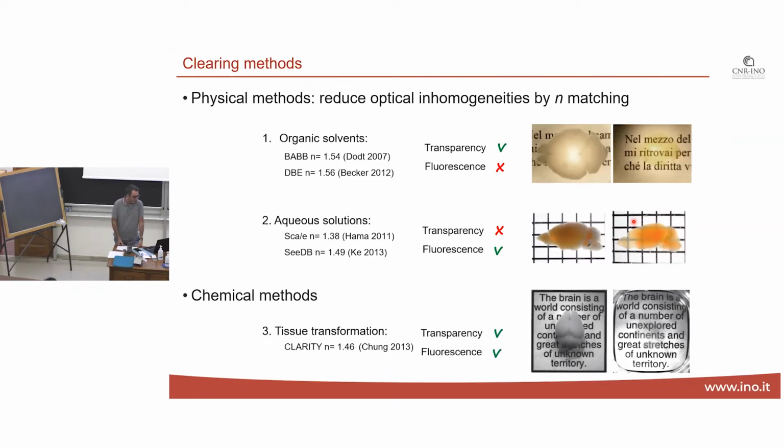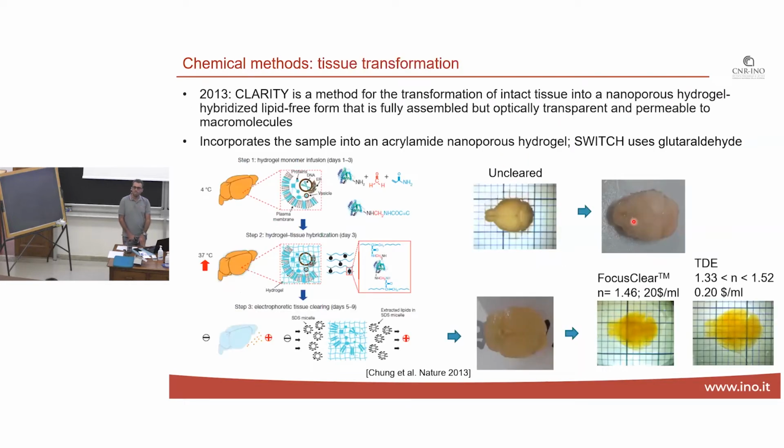These are chemical methods that are actually based on tissue transformation. This kind of technique was pioneered in 2013, so less than 10 years ago. The pioneering technique was called Clarity. This is a method for the transformation of tissue into a hybridized hydrogel form. So yes?